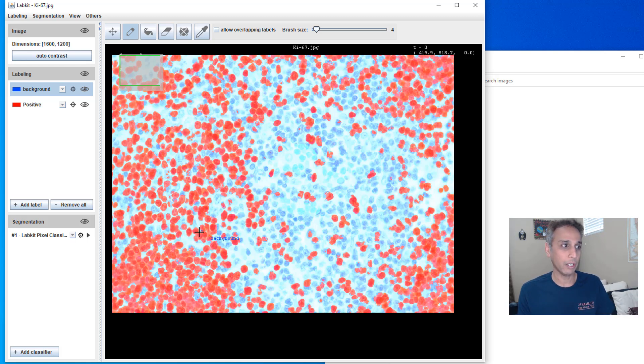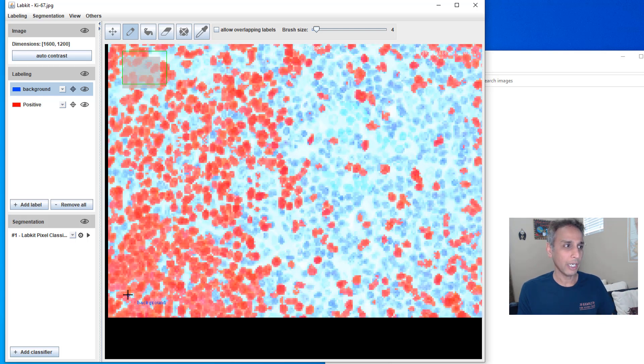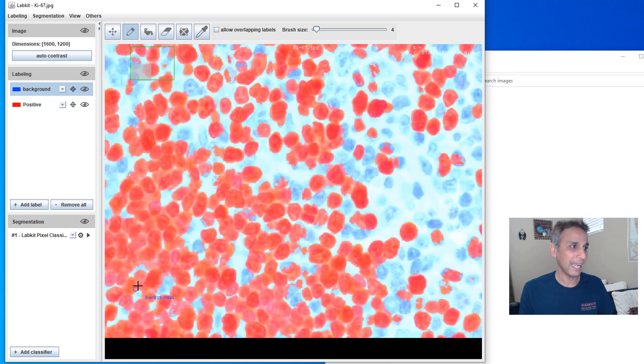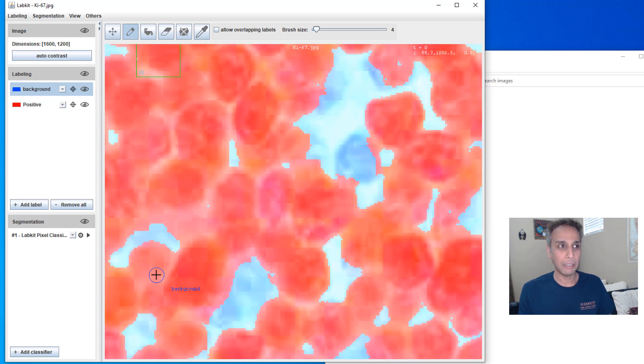Of course, it's not going to do a great job only with these few labels. This is where I get a good start. Now I need to make sure I go back and correct for any mistakes.